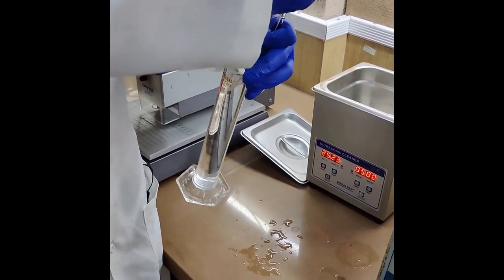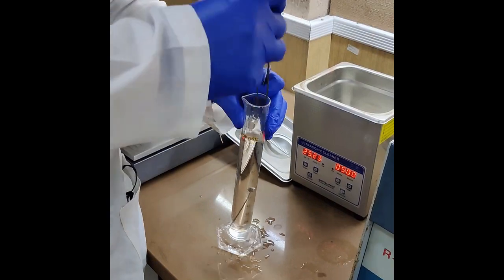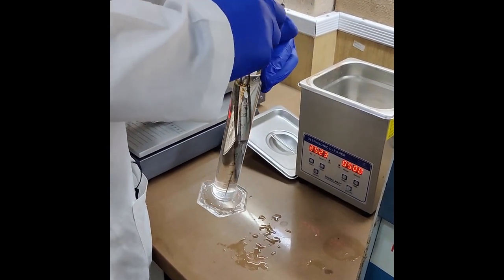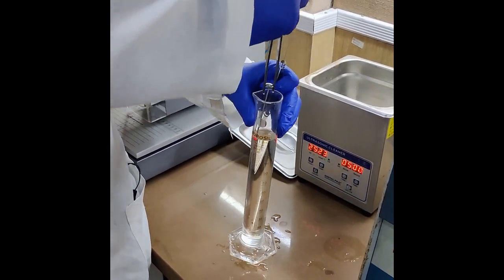Alternatively, you can also decant the solution very carefully and then remove the syringe from the measuring cylinder.